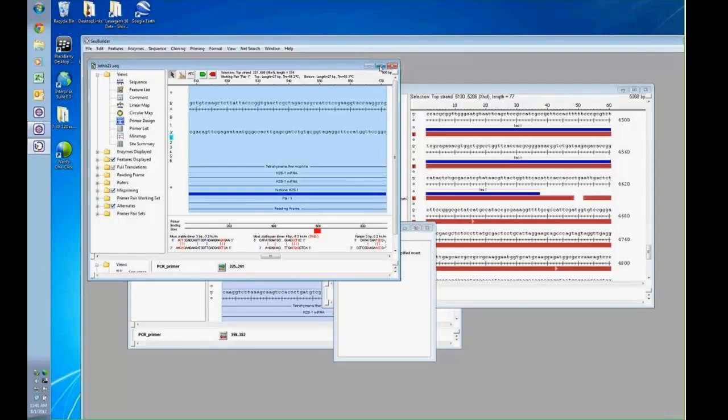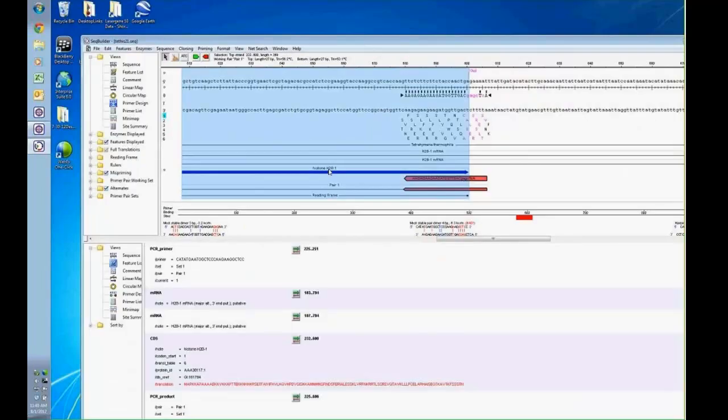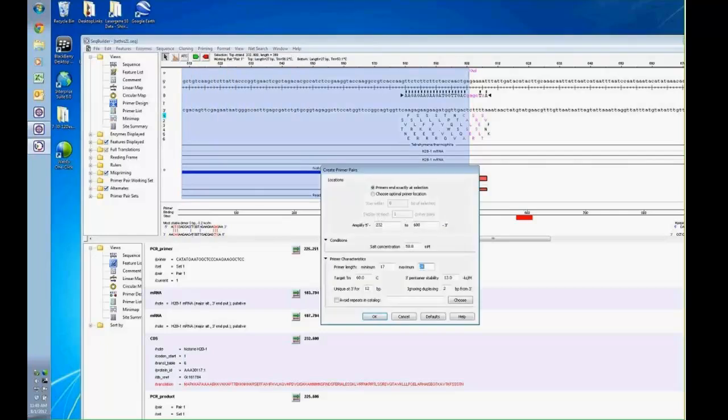With the software, I'll expand that initial target here and do the same project again. There's a number of different parameters you can change. If you want to choose an optimal primer, it does give you the option here on the left-hand side to show alternates, specify alternate primers. So you can change any of these default settings as you see fit.